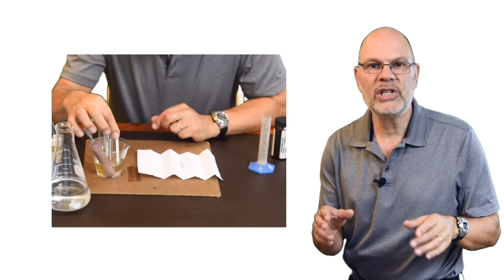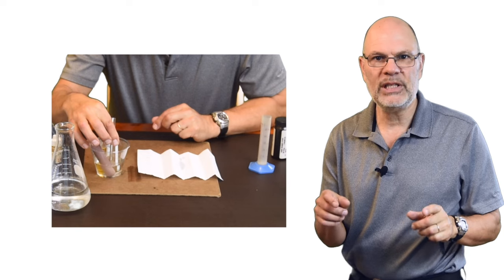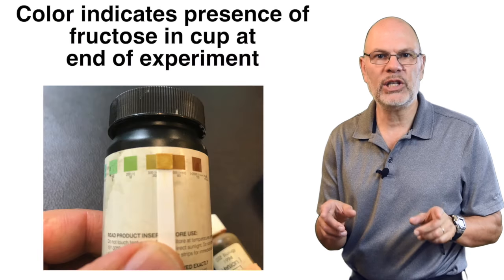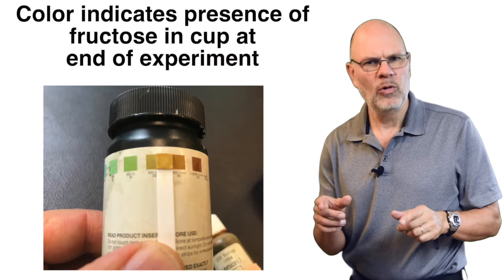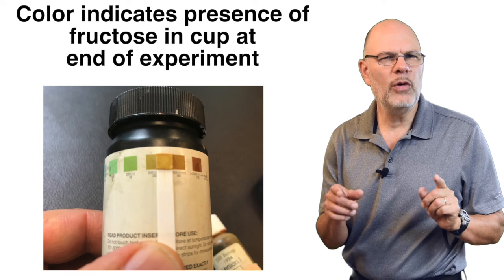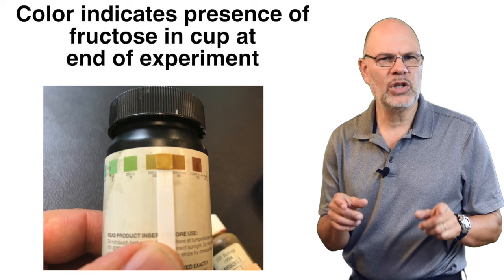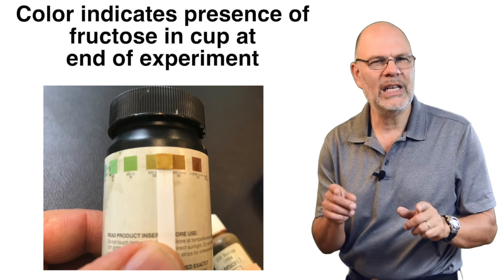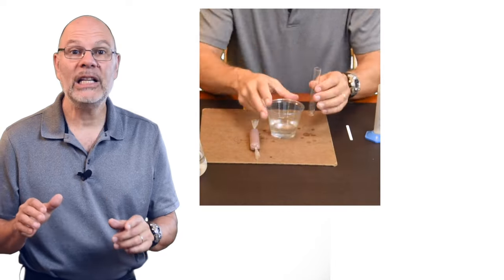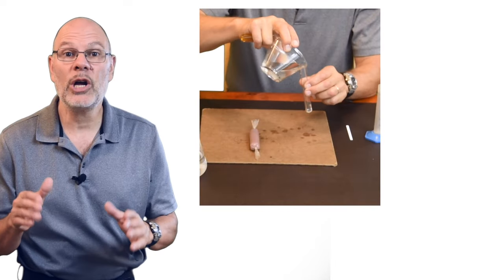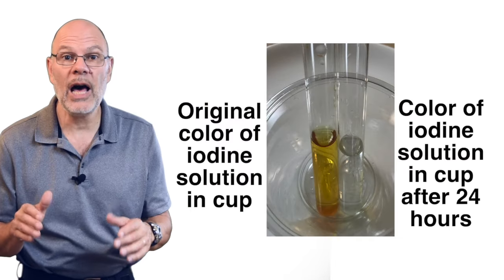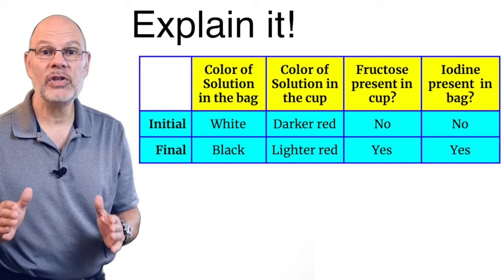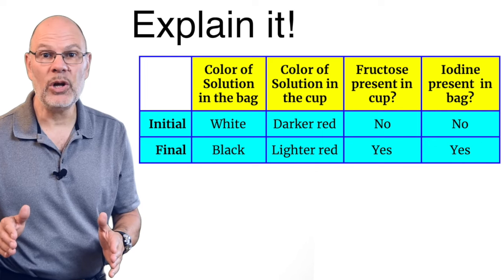Also notice that when we use this test strip to test for fructose in the cup, we get a positive result. Remember the setup — there was no fructose in the solution in the cup at the start of the experiment, but there is now. Finally, let's compare the color of the iodine solution in the cup to the color in the test tube. Here's a table summarizing the results.